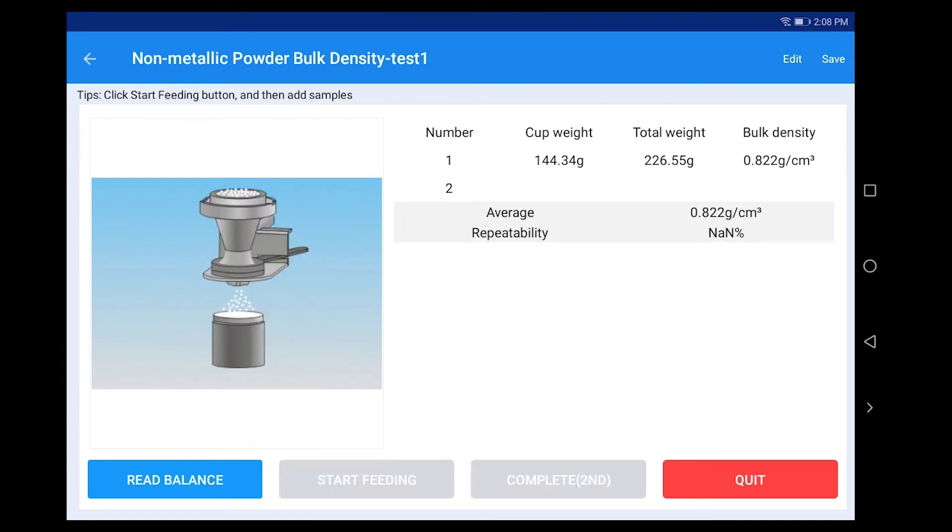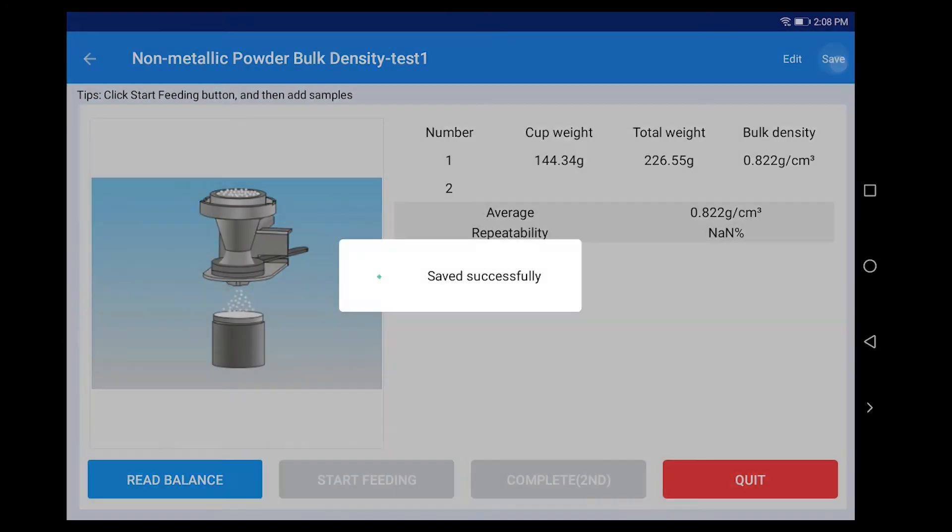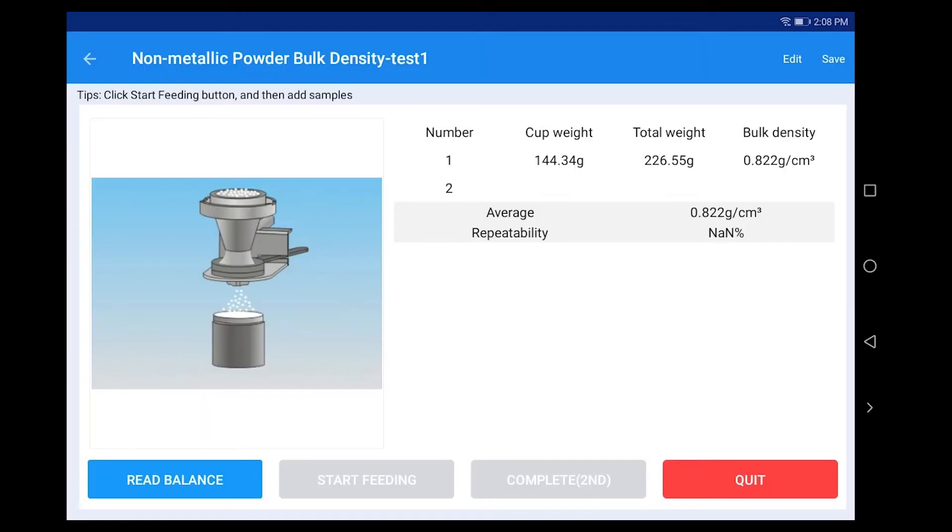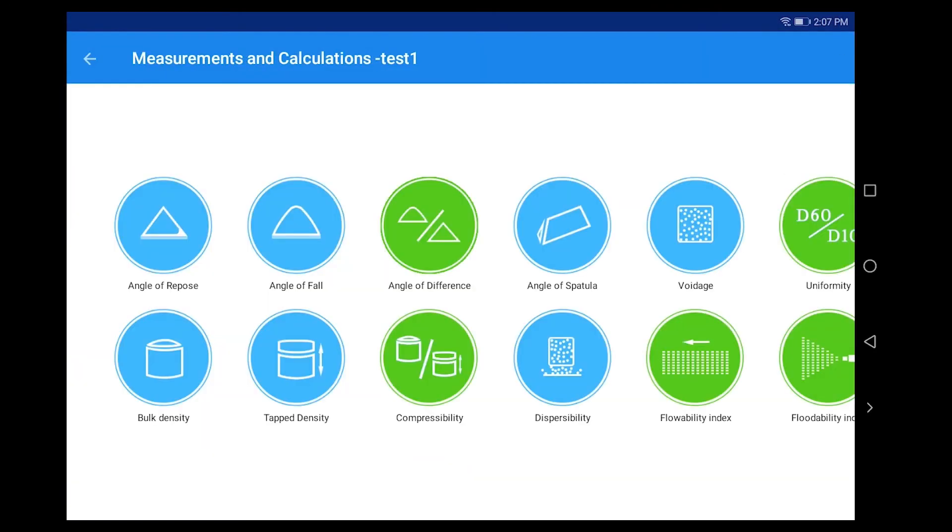Click Complete First. Click Save. And click Quit to complete the non-metallic powder bulk density measurement.